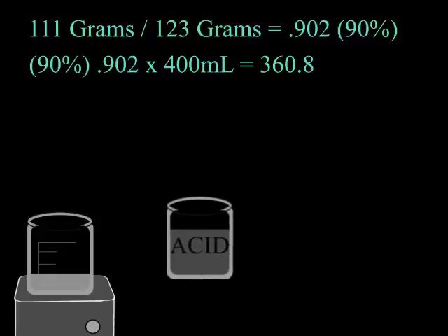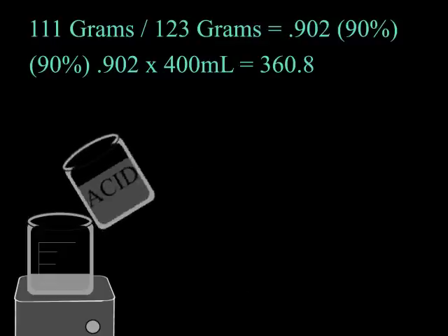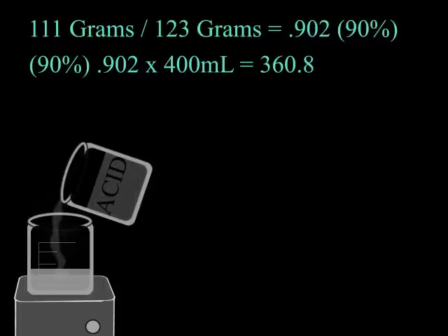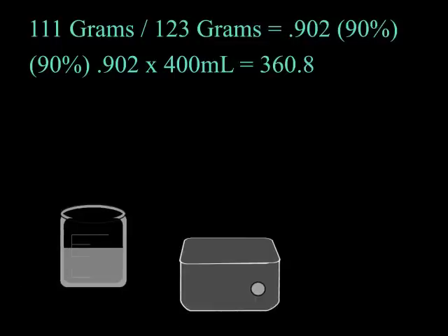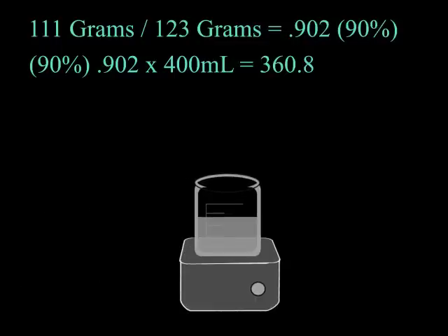If you have your SEP funnel, now would be a good time to use it. Set it up and begin stirring and adding your acid slowly, as it will give off gas and may bubble over if you do it too quickly. After all of your acid is used up, continue stirring until it no longer bubbles. Then to separate it, you heat it to boil and reduce it down to almost no water remaining.